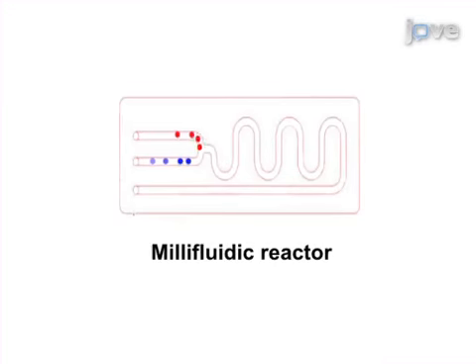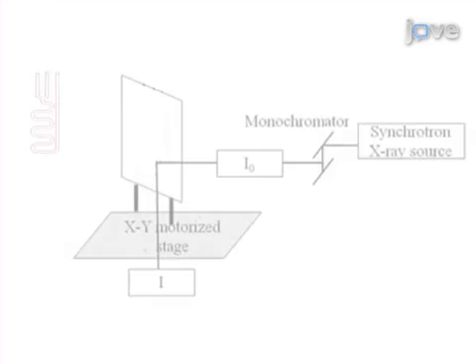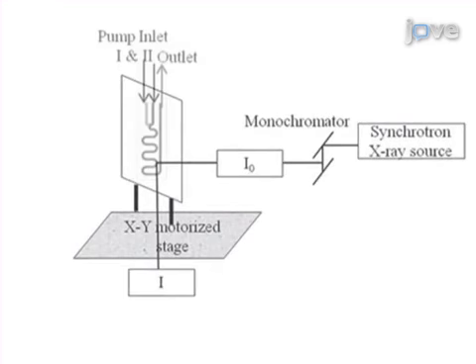This is accomplished by first demonstrating the synthesis of copper nanoparticles using a millifluidic reactor. Next, the formation of gold particles within the millifluidic channel is visualized using time-resolved in situ X-ray absorption spectroscopy in order to observe reaction intermediates.